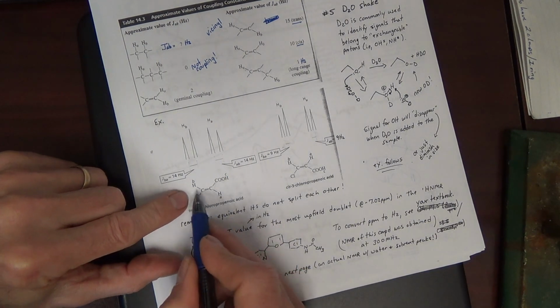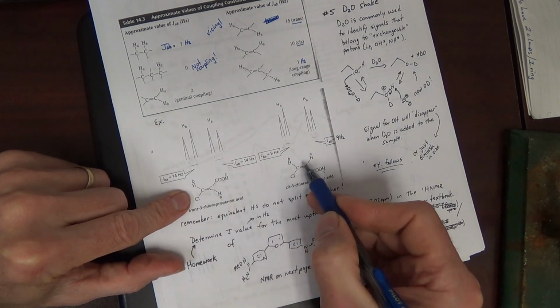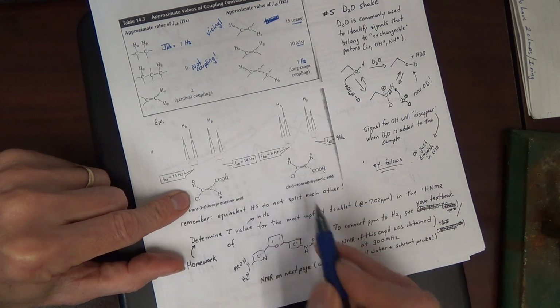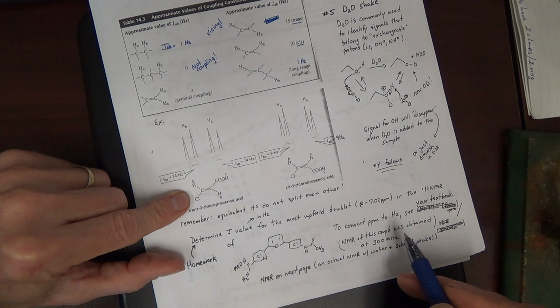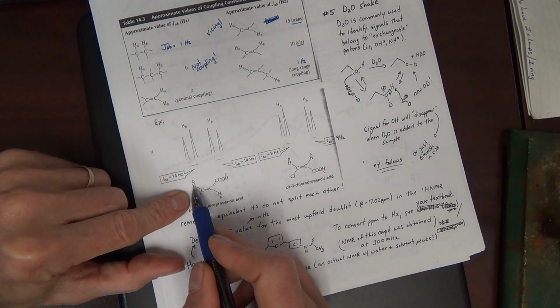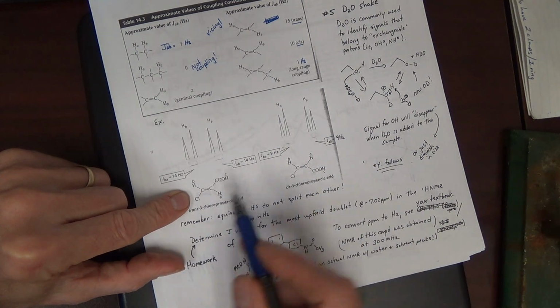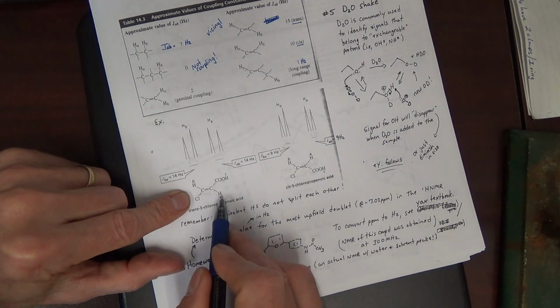Now the two H's are very similar. These two are very similar to these two. So peak position is not going to help you distinguish them. Or integration, because they're each 1,1 and 1,1. What can help you distinguish these two compounds is the coupling constant of these two H's.